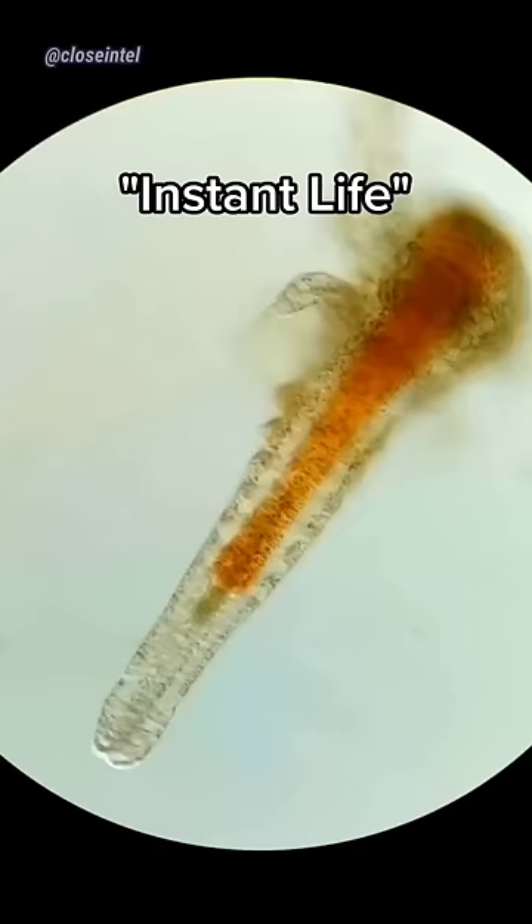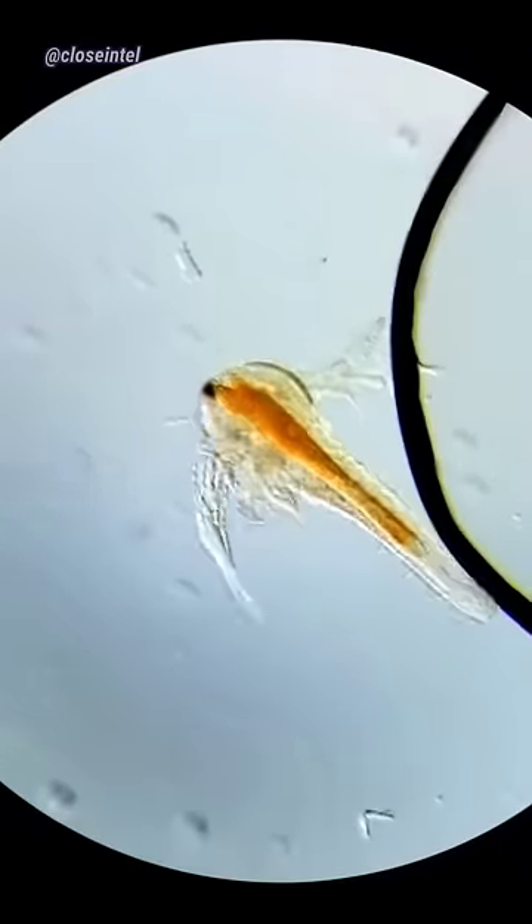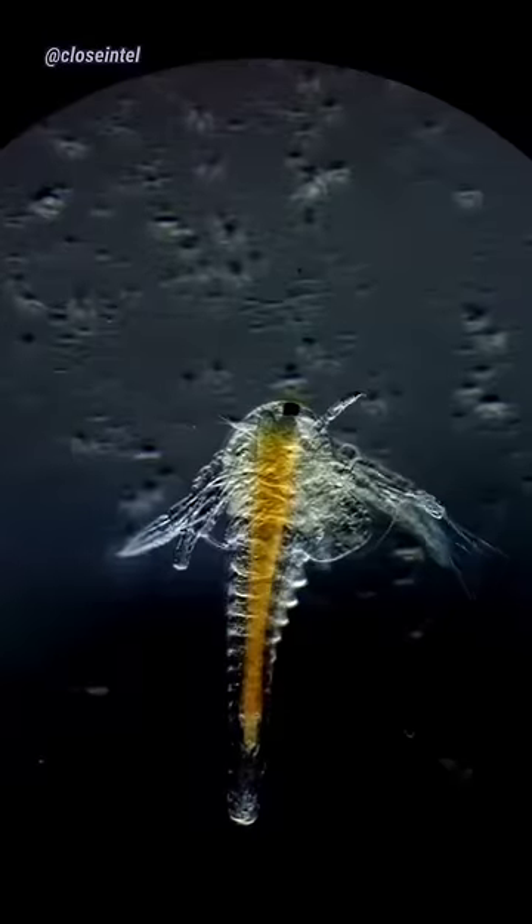They used to be called 'instant life' and it takes around one day for them to hatch, but it takes around 7 to 10 days to notice them start to grow. Once they grow too big for their shells, they shed them and even new limbs will appear.